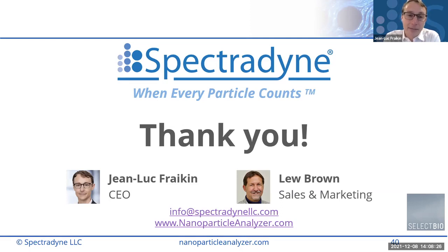My understanding is that EVs take a broad particle size distribution because of the diverse origin stories of different biological particles in a complex system. But that's the extent of my understanding of it. So I would encourage you to pursue that topic. It sounds interesting. Second one is how to compare two sample sizes when there's no mean size for each sample.